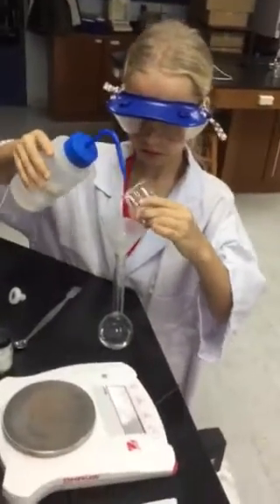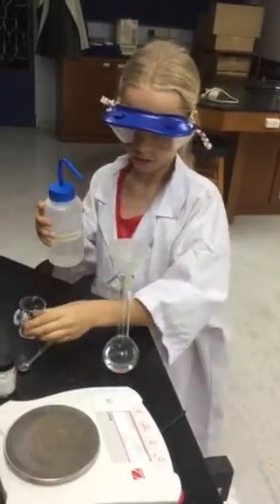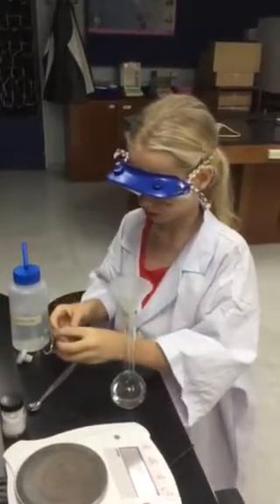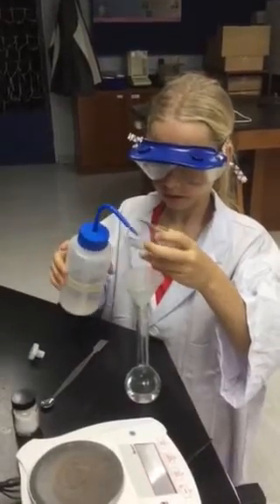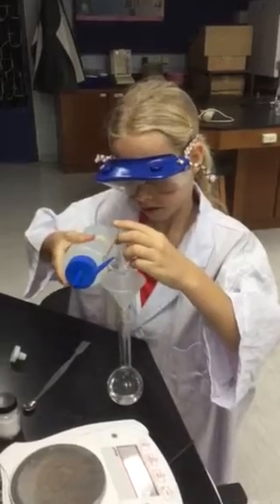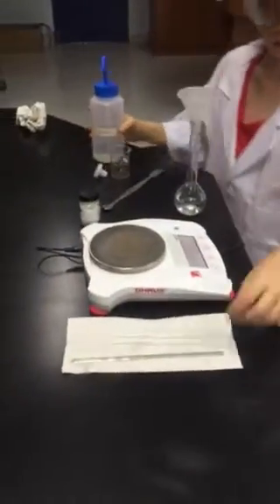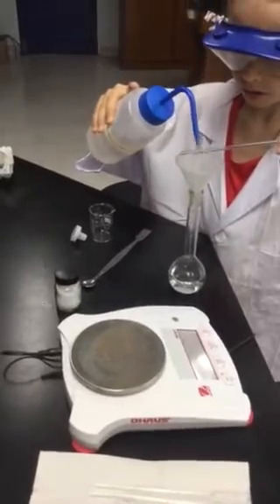That's it, just do that a little bit. Okay, and now while the beaker is upside down and over the funnel, squirt a little bit of water up into the beaker. That's it, that's the way. Excellent, thank you. And then your stirring rod also has a tiny bit of solution left on it, so let's just wash that in.